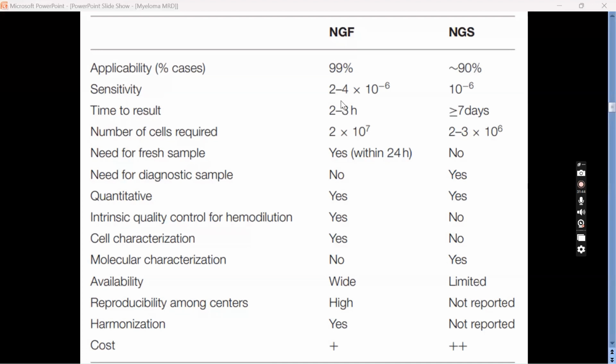You need a computer which can handle such a big file size. The analysis is the same as for 1 million events; you do the same for 10 million events. Of course, you will have some non-specific noise as a disturbance, but still you can do it. The problem is the computer, the specification needed for analysis.